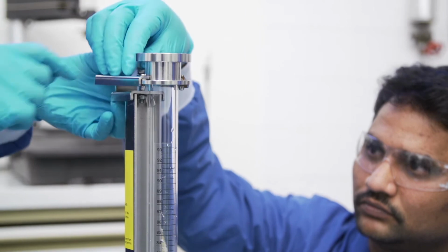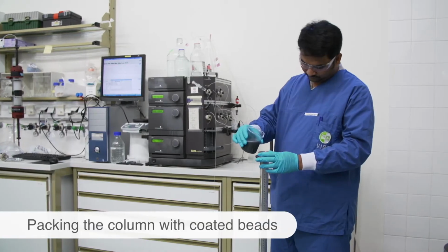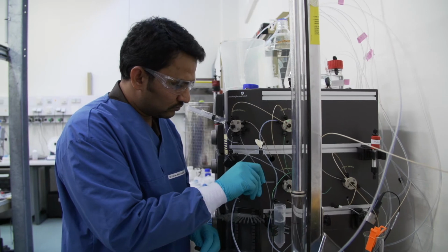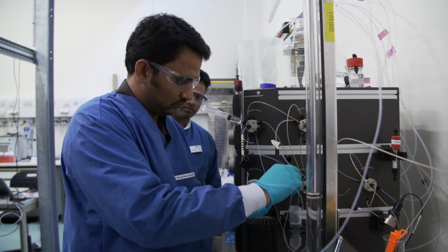EBA chromatography's higher process and energy efficiency as compared to conventional techniques have led to several applications ranging from the purification of therapeutic and commercial proteins to enzymes from yeast, mammalian, algal expression systems, and plant extracts.